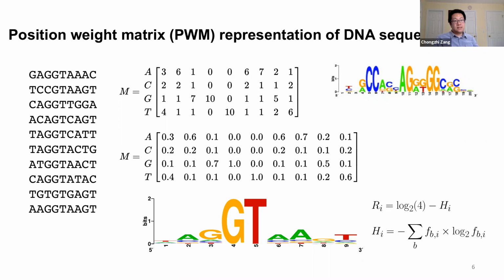A ChIP-seq experiment can directly tell us that, because we generally believe that the binding sites or peaks identified from ChIP-seq are real DNA-protein interaction sites, even if those specific regions do not have the canonical binding motif.